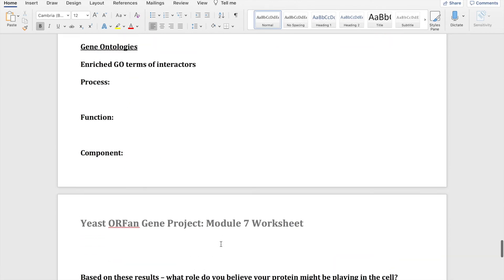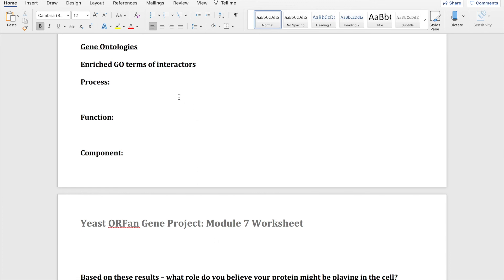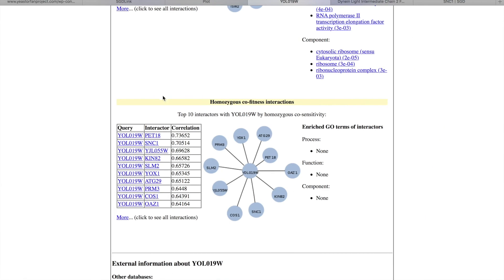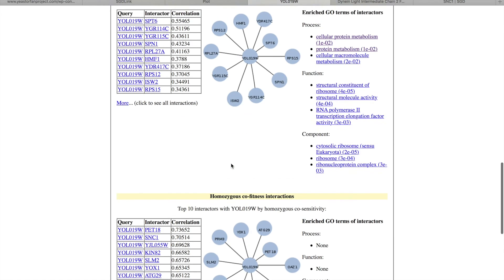So now we're going to go onto the gene ontologies or the GO terms. GO ontology aims to standardize representation of gene and gene product attributes across databases. Genes with known functions are grouped into all of the categories that that function applies to, with respect to molecular function, biological process, and cellular components.